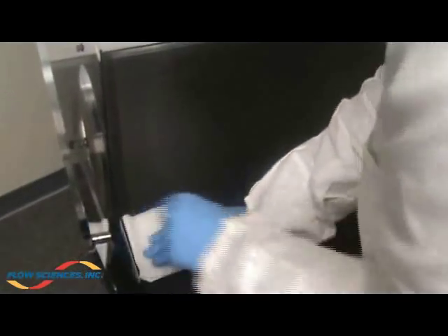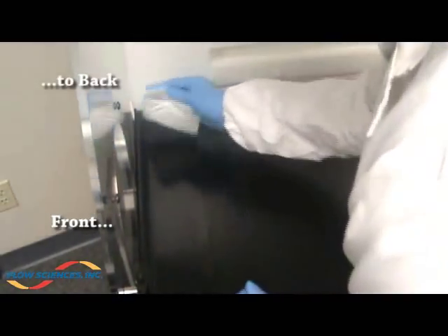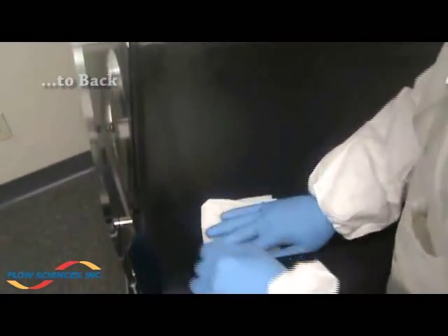Next, wipe down the bottom phenolic base, cleaning from front to back, overlapping each stroke by ten percent.